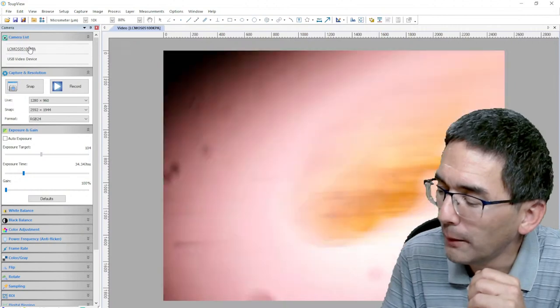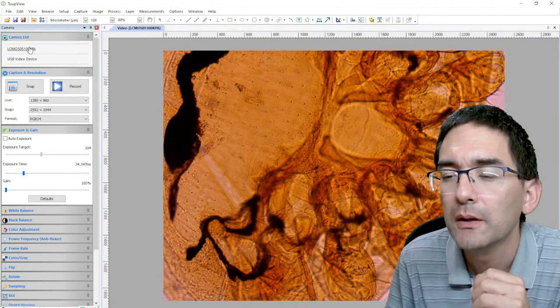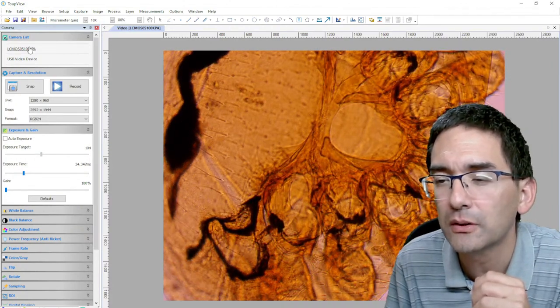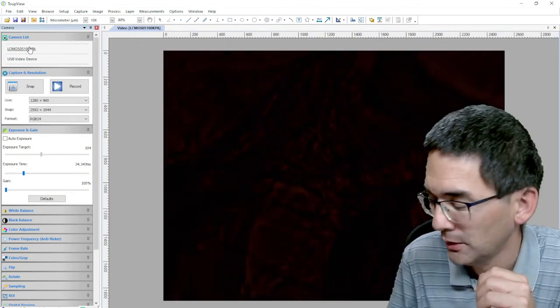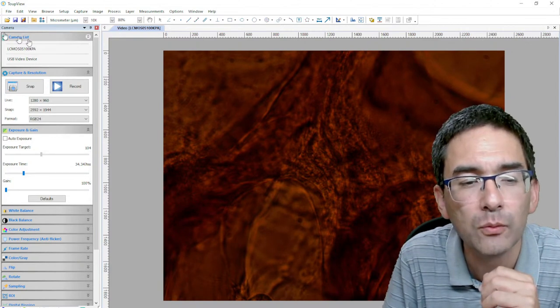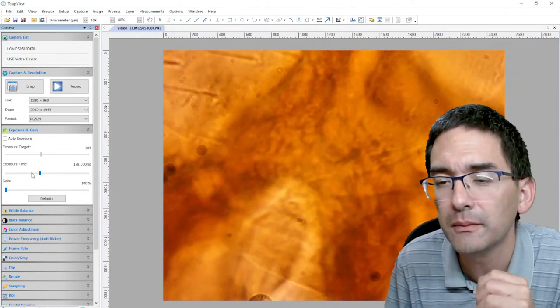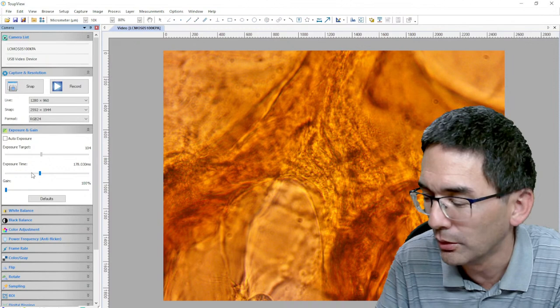And this means if you go up with a magnification like this, let's go up a little bit also with the brightness. And when you focus, you see the different parts come in and out of focus. If you go up with the magnification further, you have to go up with the brightness, of course, as well, maybe even with the exposure time. Then you see the frame rate goes all the way down. Then it's even more of a problem.